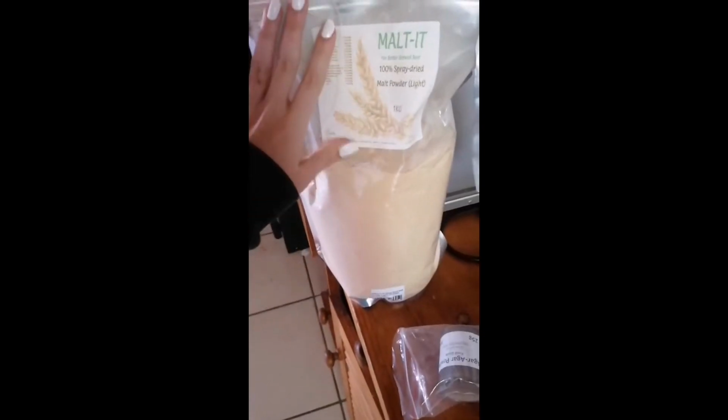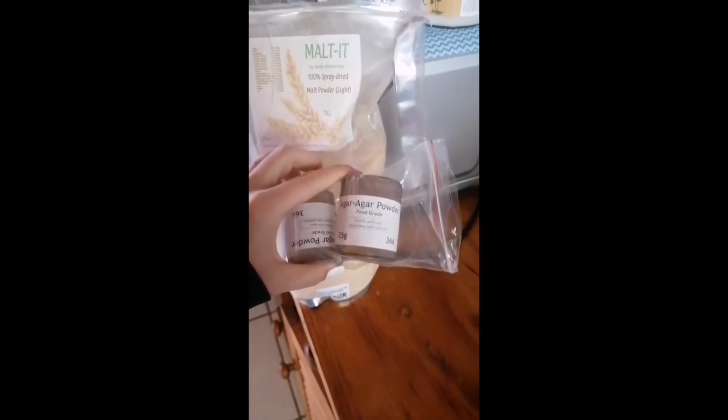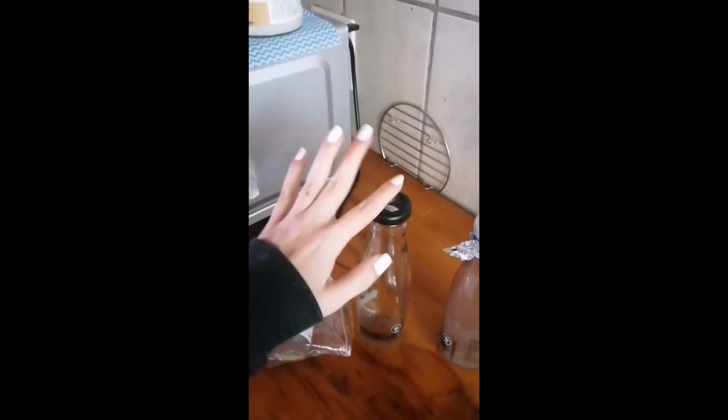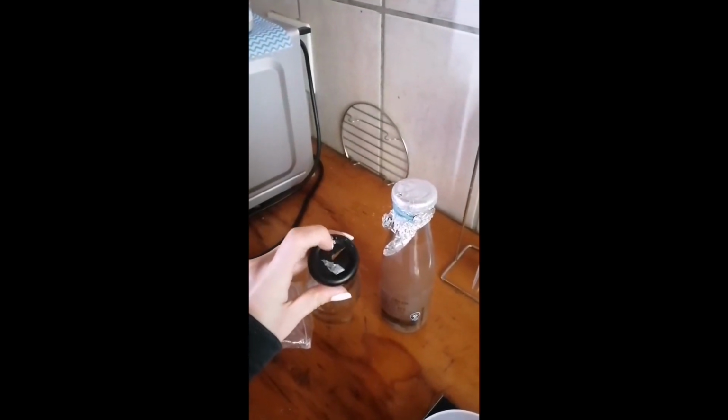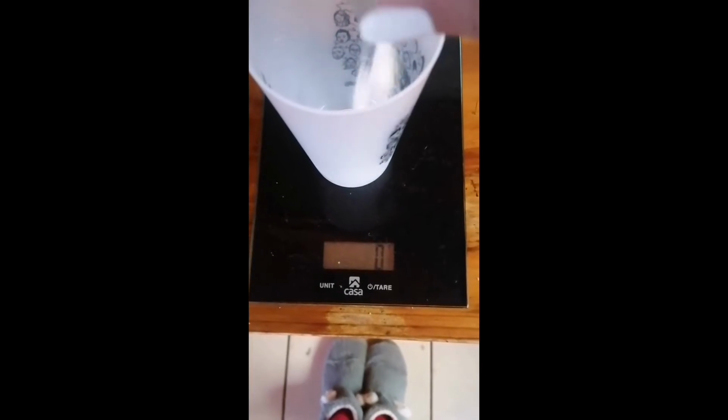Okay, so first we have some light malt extract, some agar powder, and then the glass bottle that I will be putting it in. And this is some old agar that I'm just gonna steam bath one more time. And this is how I know that it works. There is a hole in the top of that bottle for some airflow.